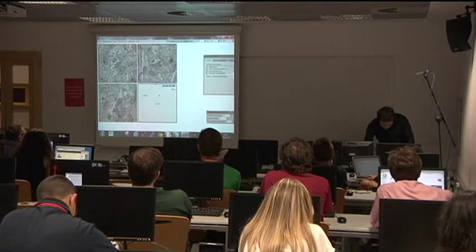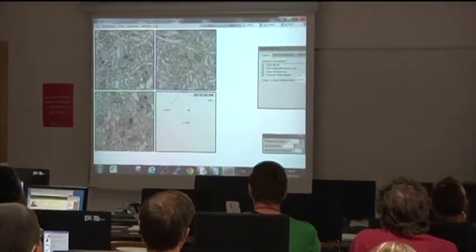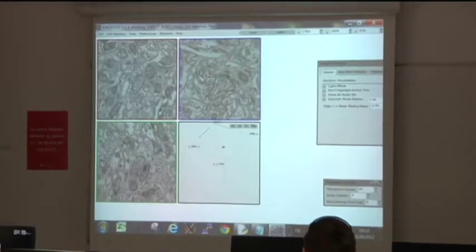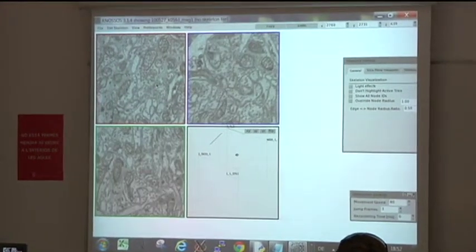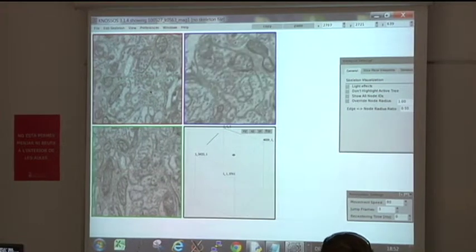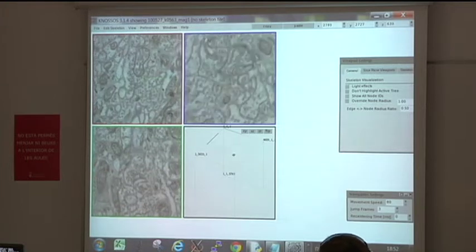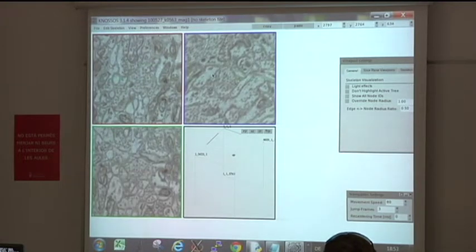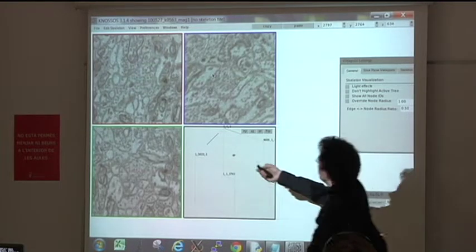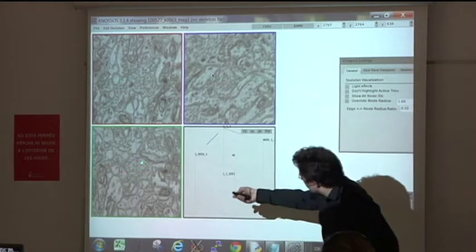Okay, now again, mitochondria, ugly here, mitochondria. There's only one other structure that I'm going to show to you, which is, we talked about the brain being there to transmit signals, and it does so largely also by chemical synapses, and chemical synapses need vesicles. That's where the transmitters are. So I'm now going to introduce you to vesicles, if you haven't seen them before. So these small dots here are vesicles, and you can see them here also.